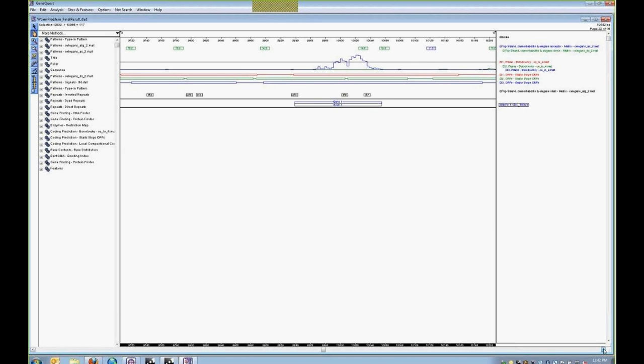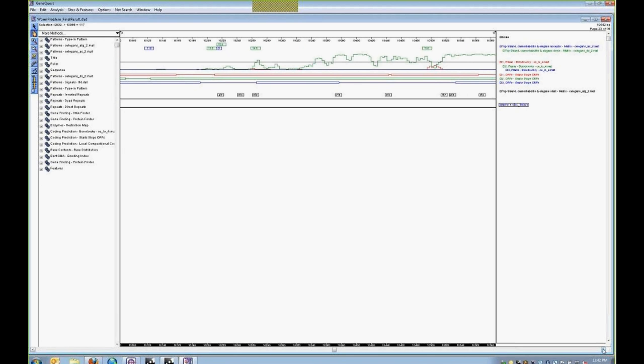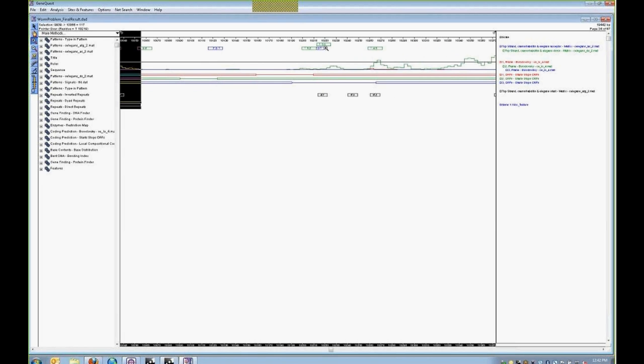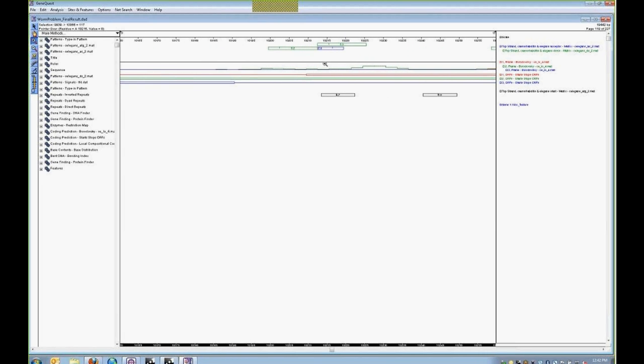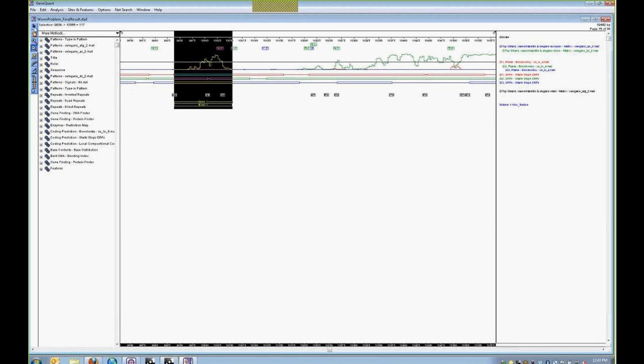So moving forward, what we need to do is identify another Borodovsky region, and in this case, we don't need a start site. What we need is an acceptor site. So we can see that we have a nice Borodovsky peak starting, and we have an acceptor site with a score of 12. So that's a very high score for acceptor sites. So I'm going to zoom out here just to make it a little easier. And this is very likely a candidate for the beginning of exon 2.